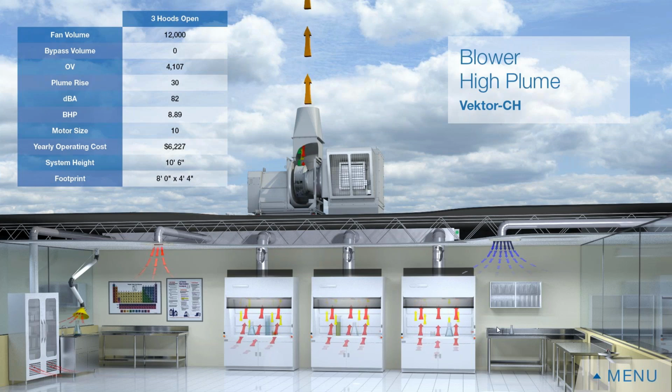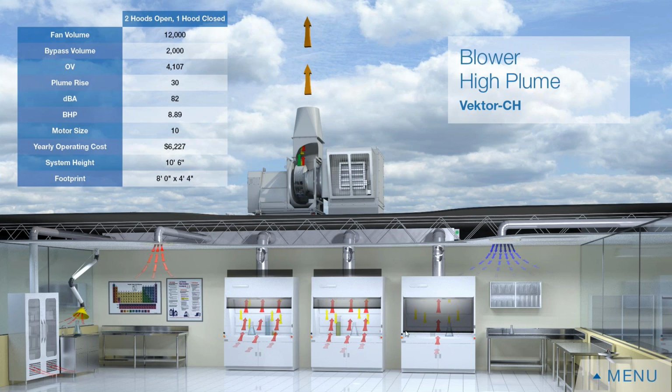So when you're in this situation and it's 100% exhaust, so that all your sashes are open, and Justin mentioned the pressurization in the room. We generally want to maintain negative static pressure. So in the simplest terms, we have more red arrows leaving this space than blue arrows coming into that space. My bypass damper is closed, the fan is getting the appropriate flow. But one of the items that you get with a variable volume system is that when you start closing your sashes, now I go from 3 arrows to 1 arrow because this little valve is working.